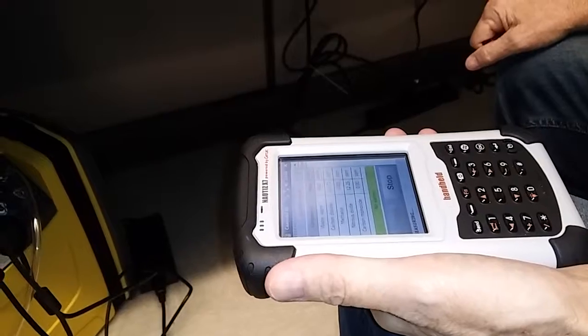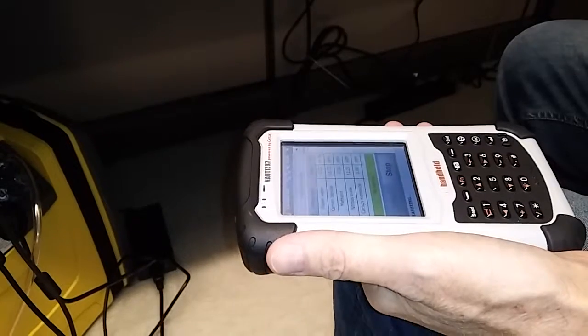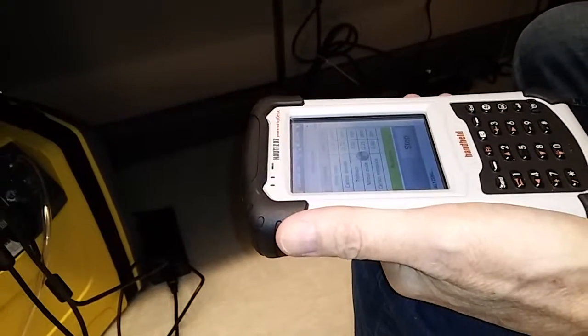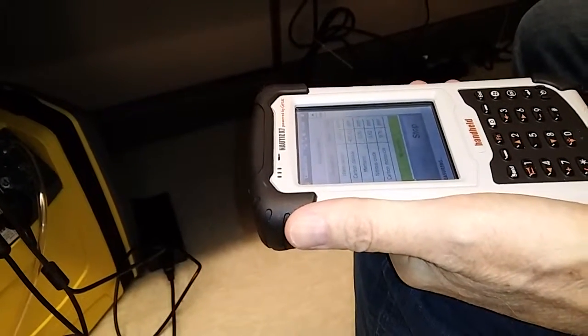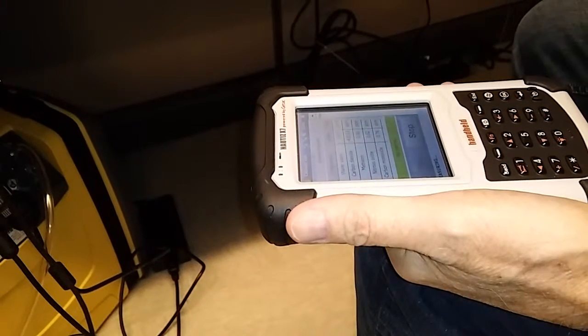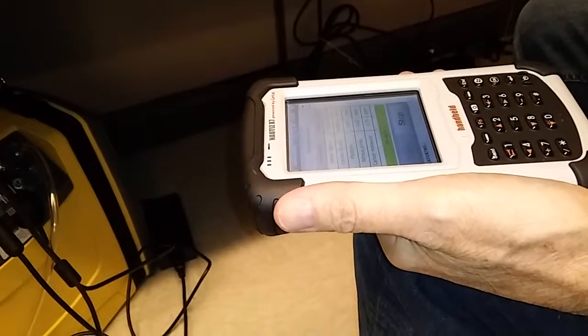Yeah, it's still showing nitrous in the cell. So I guess I don't know how many times you have to flush it. Oh, the next one, let's see what it shows. Okay, we're down to 0.62, but our carbon dioxide, apparently it's off a bit. It says minus 435. Supposed to be calibrated. Yeah, I gotta calibrate carbon dioxide. Oh, we gotta zero it, is what we gotta do.